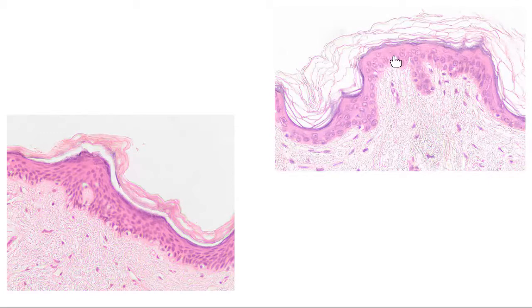Remember, by the way, when we talk about stratified epithelium, you have to go above the very outermost layer. That's the shape. That's how we look for the shape. So these really flat, skinny cells here on the outside, those are the squamous cells. We can't use our shapes down here at the bottom to tell what we're looking at here.